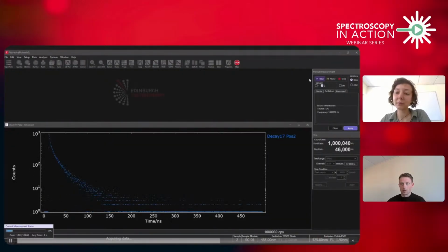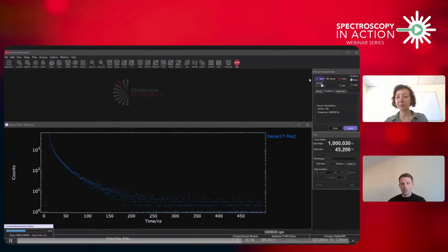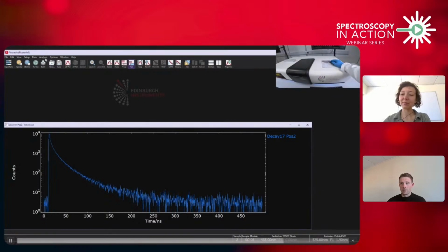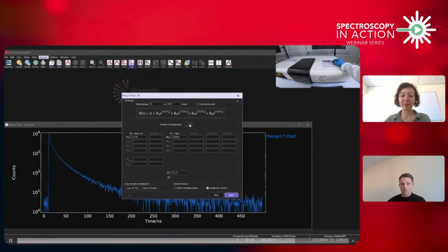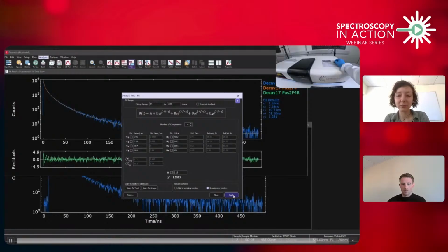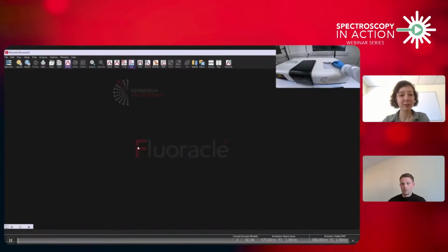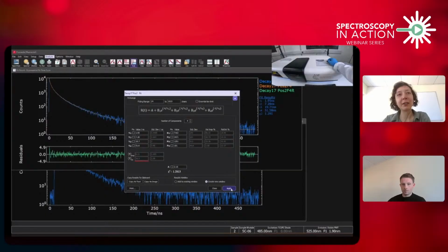So here, the photoluminescence decay is recorded photon by photon using time-correlated single photon counting. The current progress is shown in the lower left. So once our decay has been acquired, we can then fit it to obtain the lifetime. So for this sample, I'm using a 4-component exponential model to fit this decay. And we can see that it has an intensity-weighted average lifetime of around 16 nanoseconds, which is that sort of red flashing parameter on the screen there. Okay, I'll just leave it there in that frame.